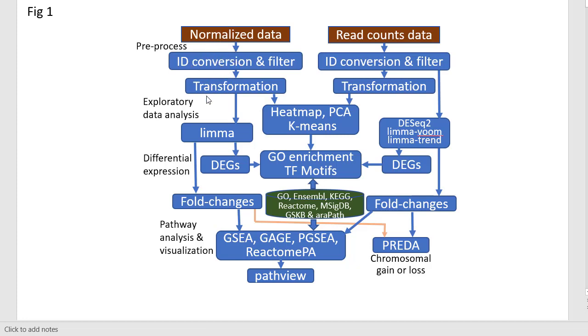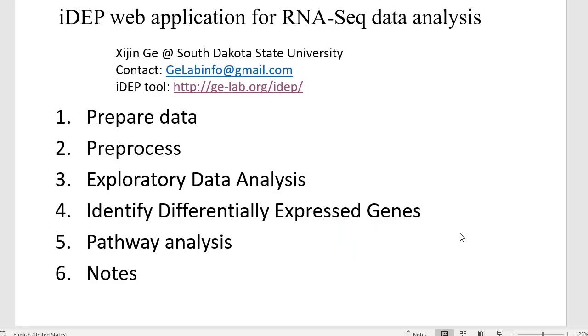does gene ID conversion, data transformation, exploratory data analysis, differential gene expression, enrichment analysis and pathway analysis, and a lot of data visualization. So we're going to follow the iDEP pipeline in this video and talk about these steps today. The URL for the tool is here, and you can contact us through this email.